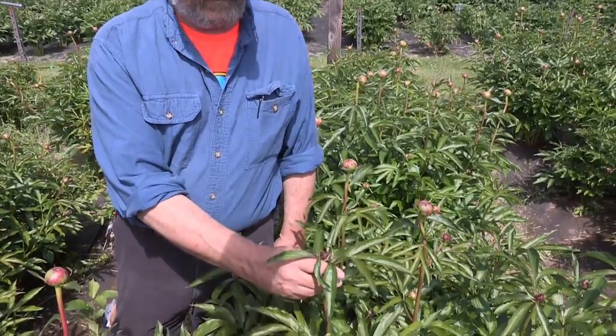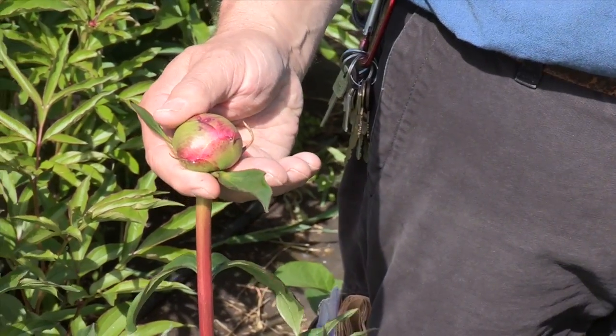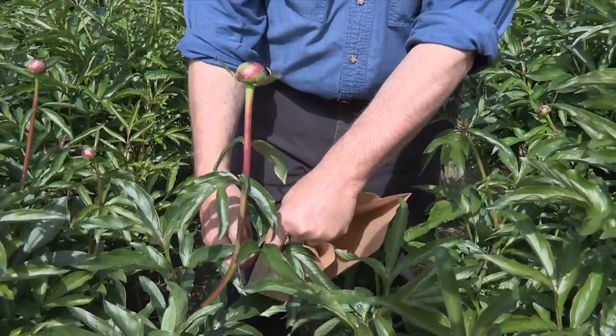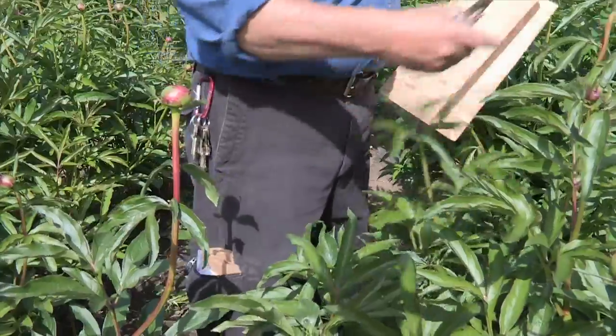In this case, peonies should be at a bud maturity index of 2.5, where a single petal separates at the top, exposing the flower, and the bud itself is still hard. The plant part that needs to be collected will be the first set of leaves, plus the petiole directly beneath the bud. You can remove the leaves from the plant with a sharp knife or a pair of scissors.